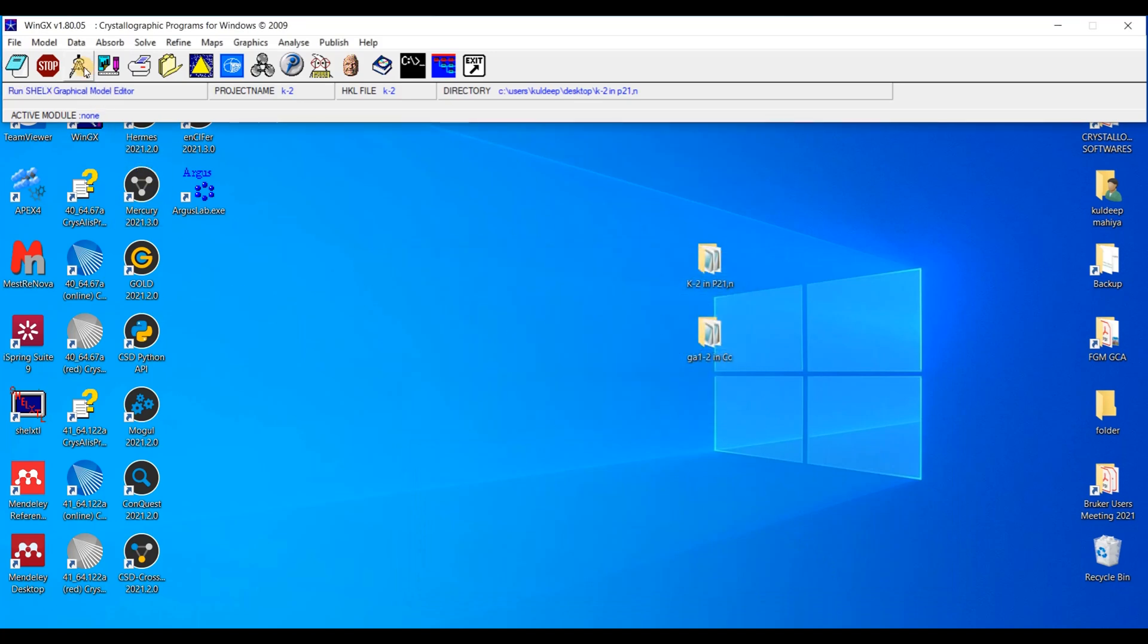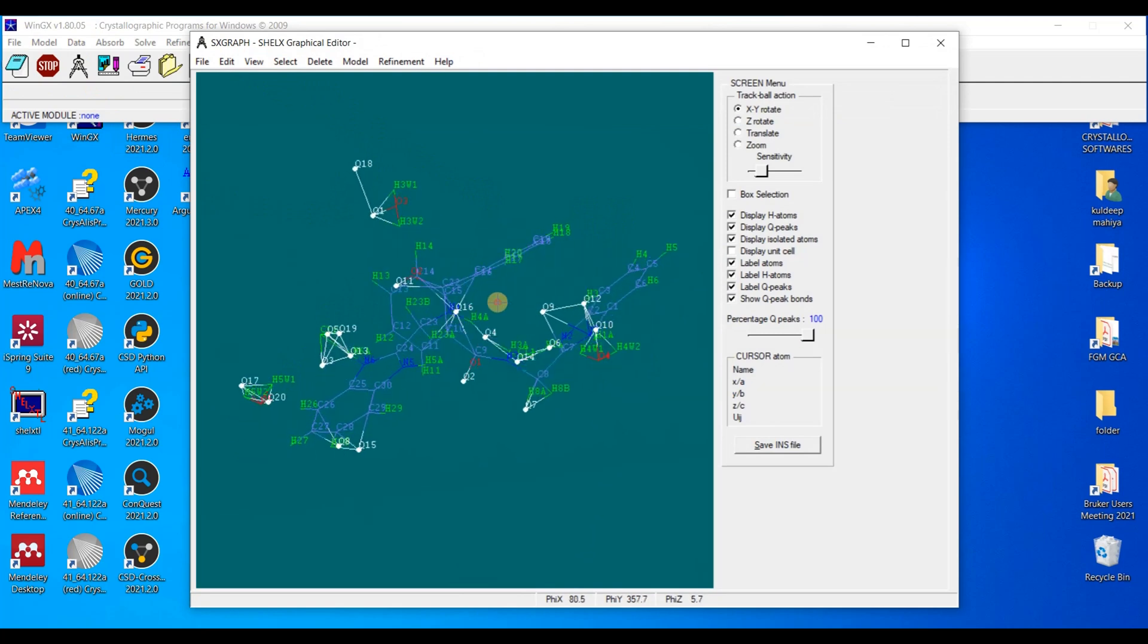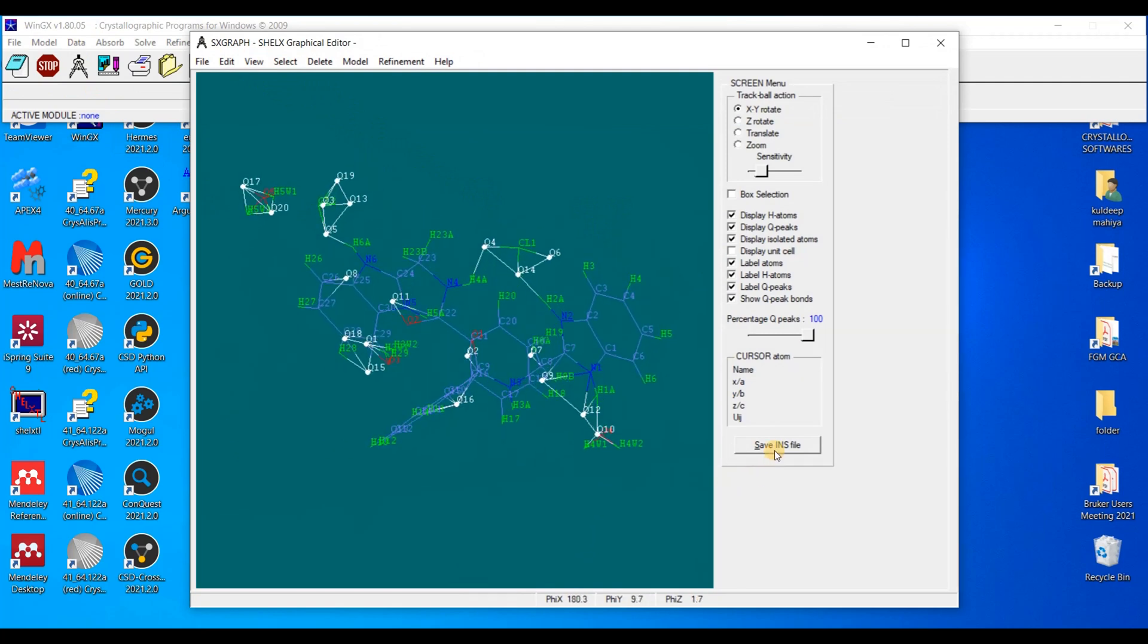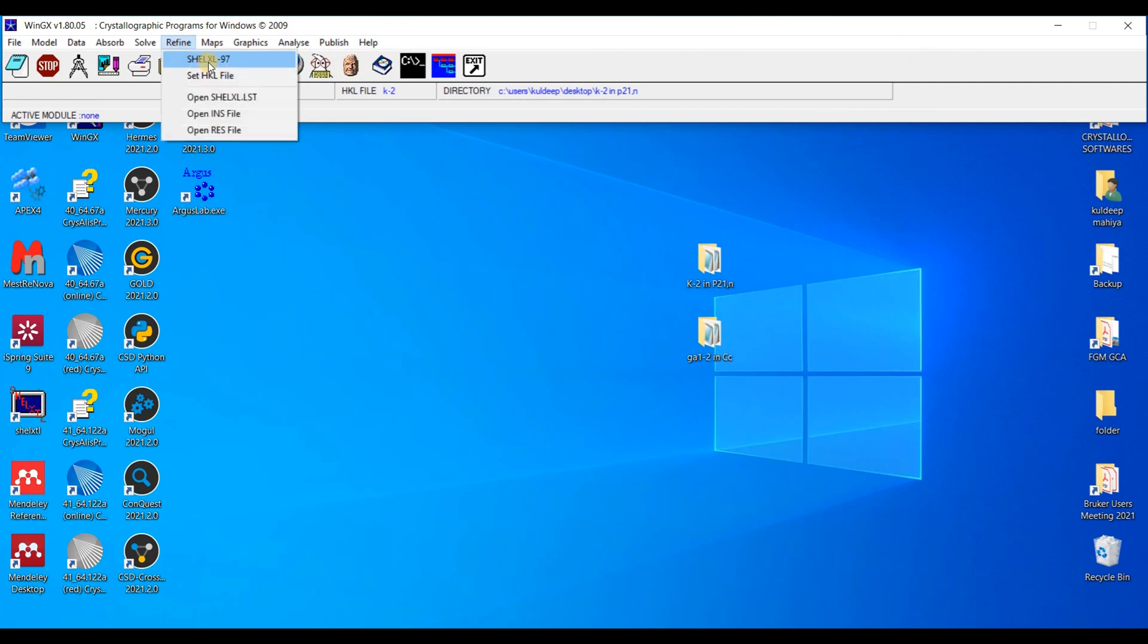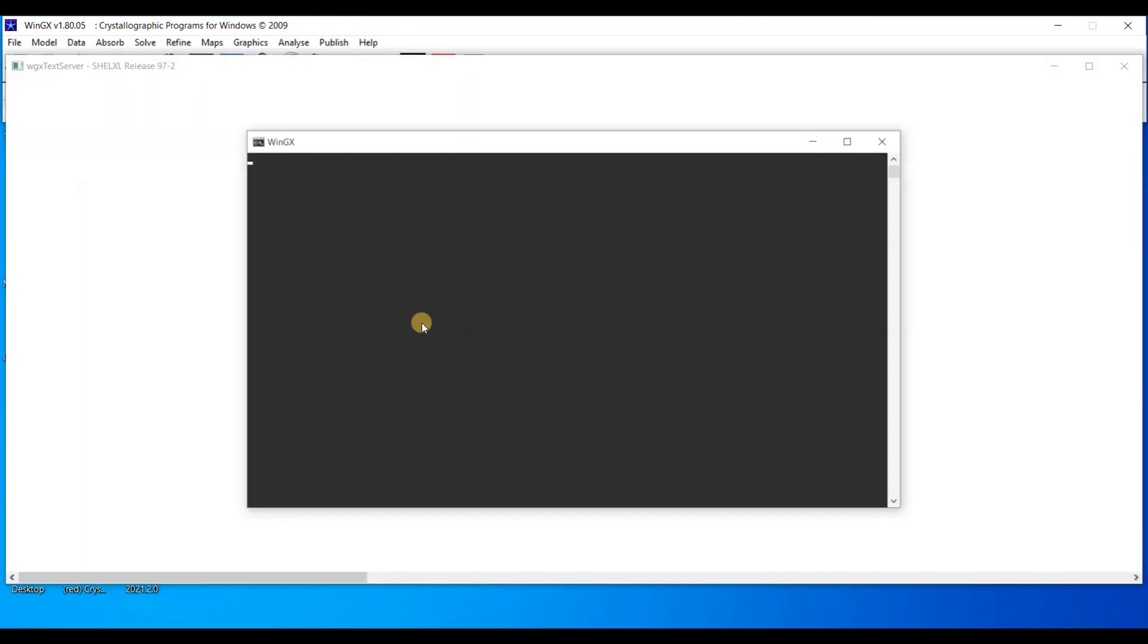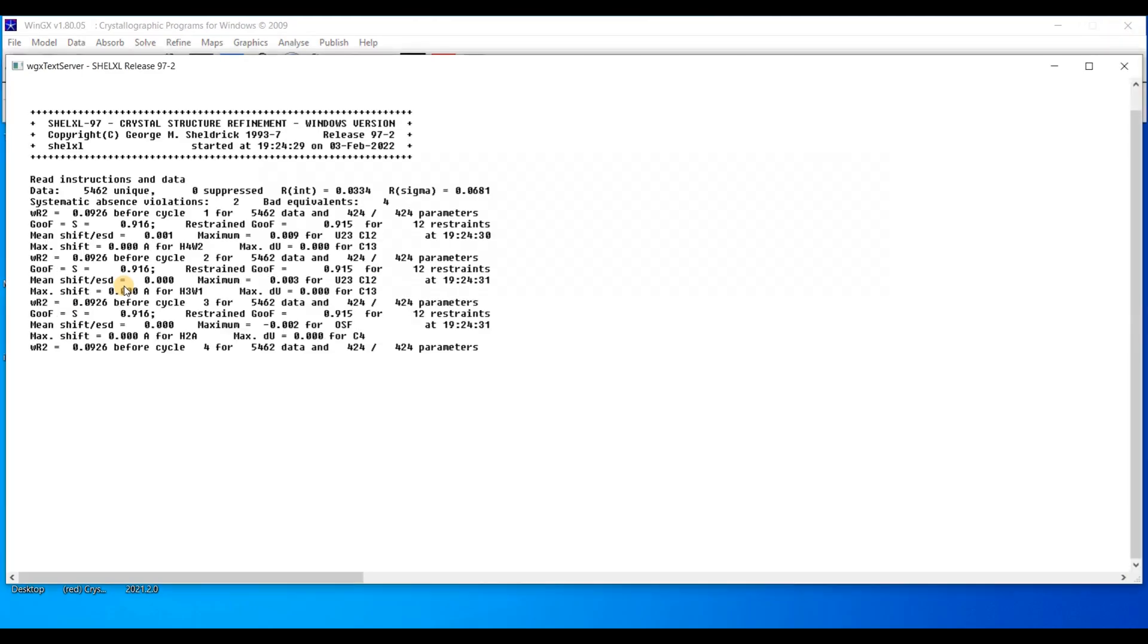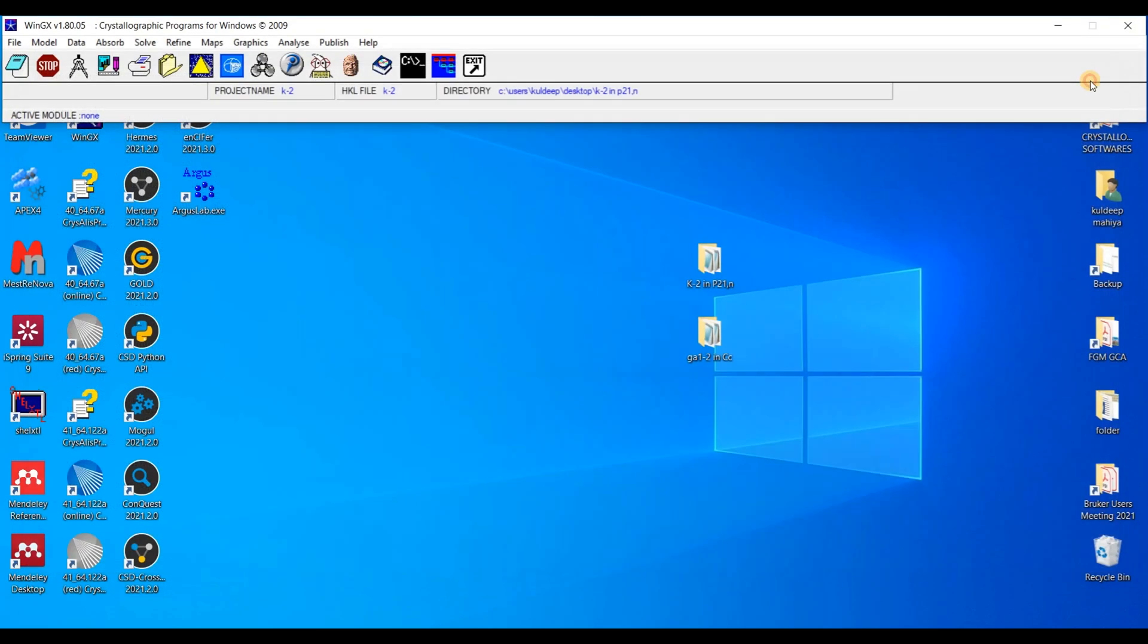So just press this button and it will open the ShelXGraph. This is the structure. Save as INS and I am going to refine with ShelX97. I am using this version ShelX97 for this purpose. And you can see the final R factor is 4.54.